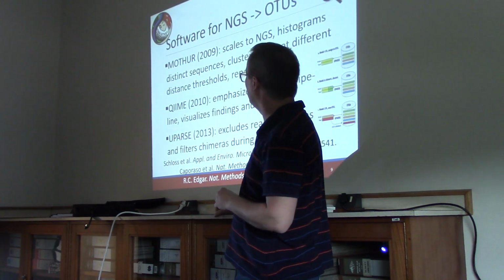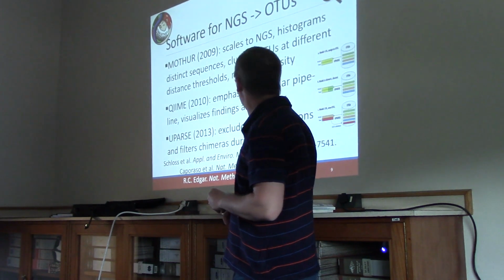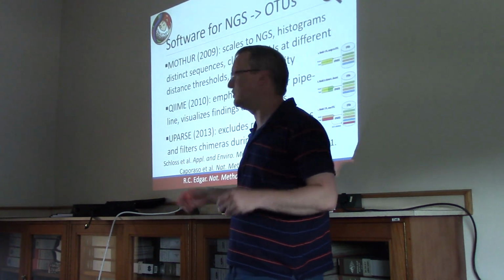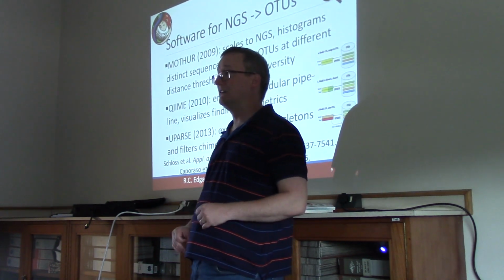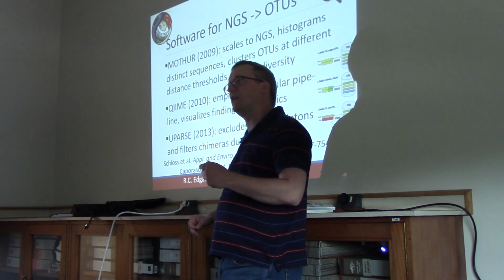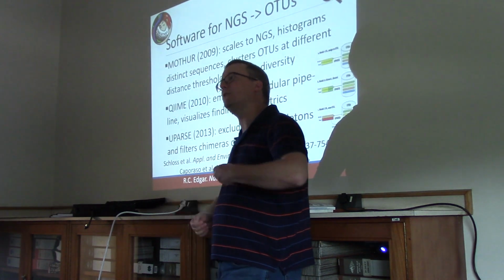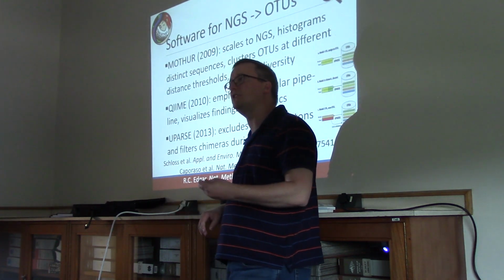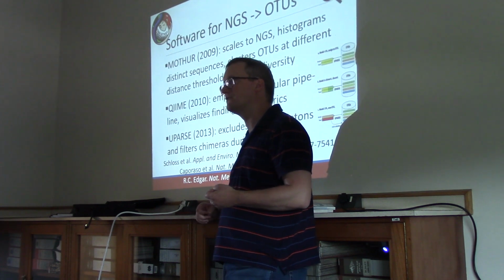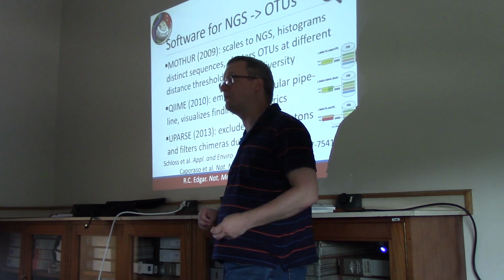So I'm not going to tell you that you need to use MOTHUR because it has a beautiful icon, or that you should use QIIME because it's a modular framework, or UPARSE because this arrogant person was actually right on. Most frequently the software that you choose for assessing OTUs out of your sequences is going to depend on whether there's a postdoc in the lab who's done this before. What did they use?